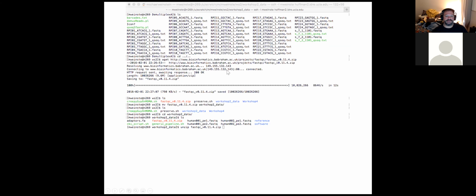All right, is everybody seeing my other set of slides now? So you should be seeing a slide that looks like a command prompt. Okay, awesome.